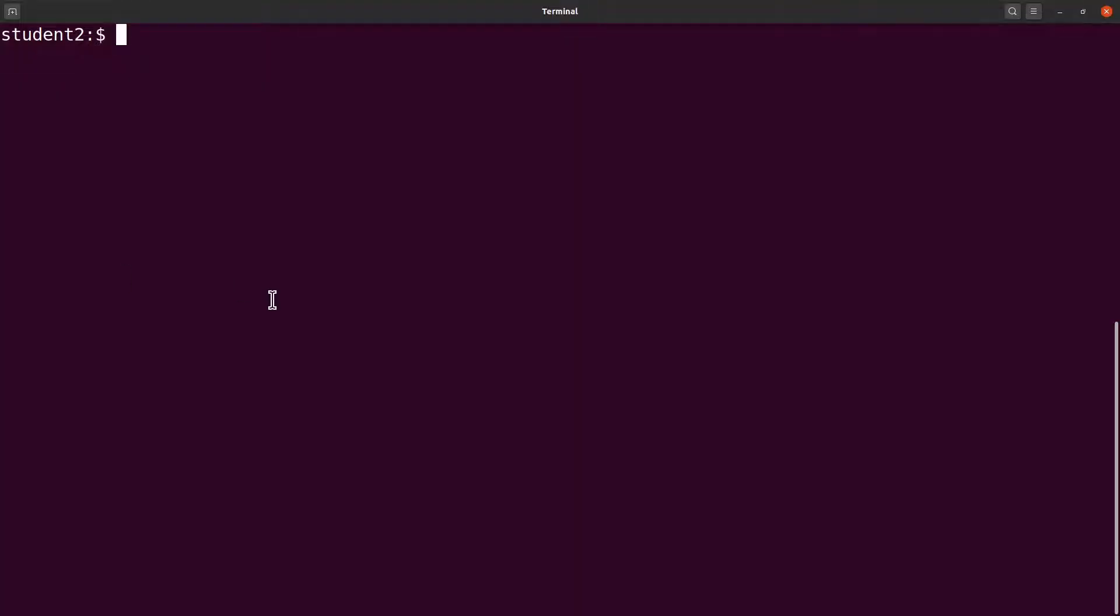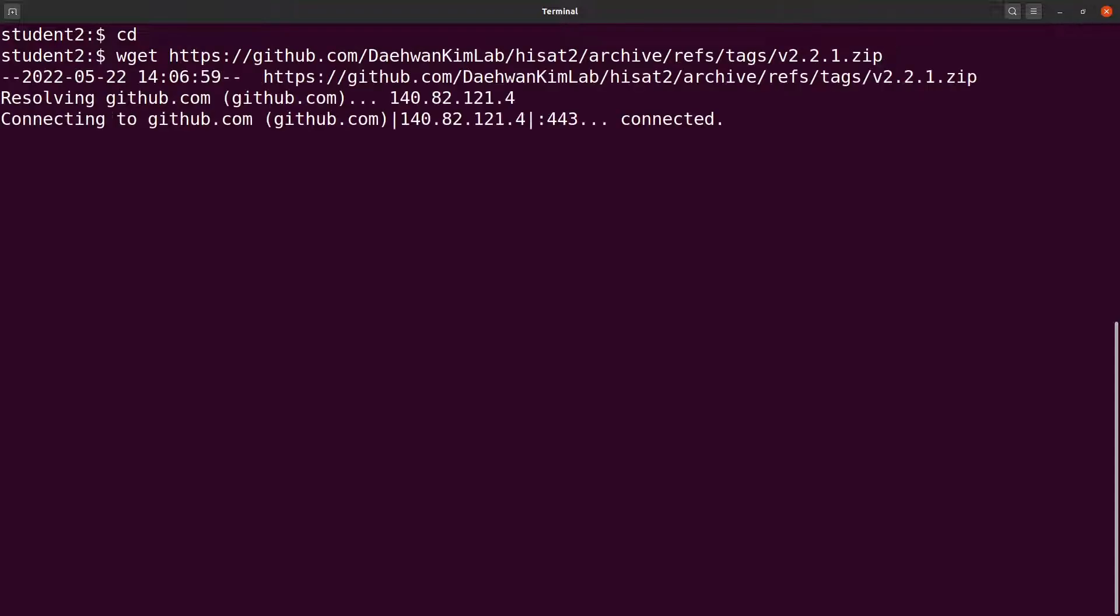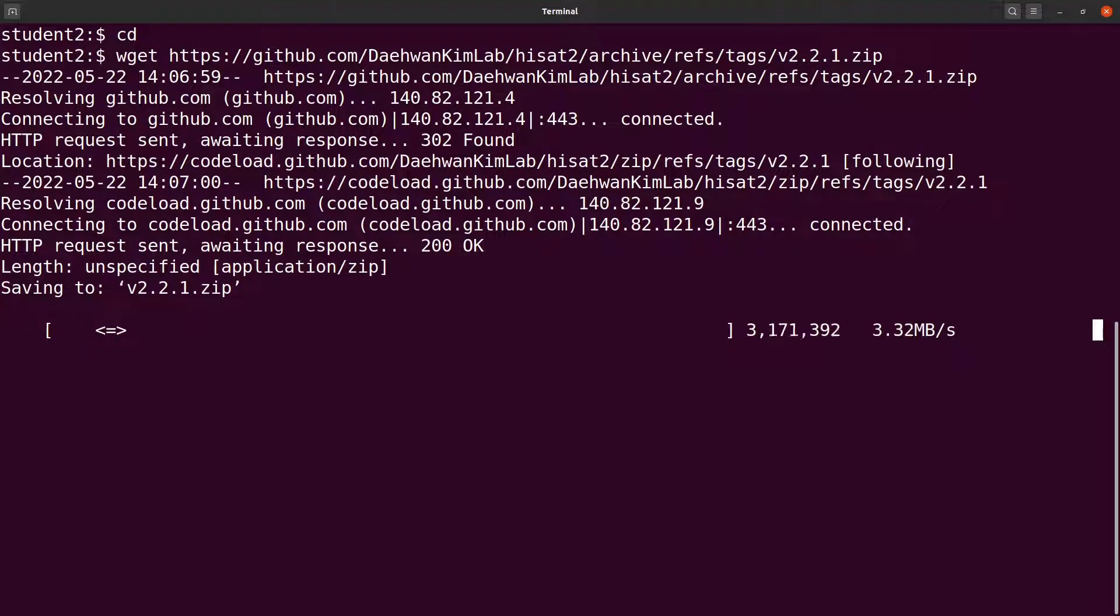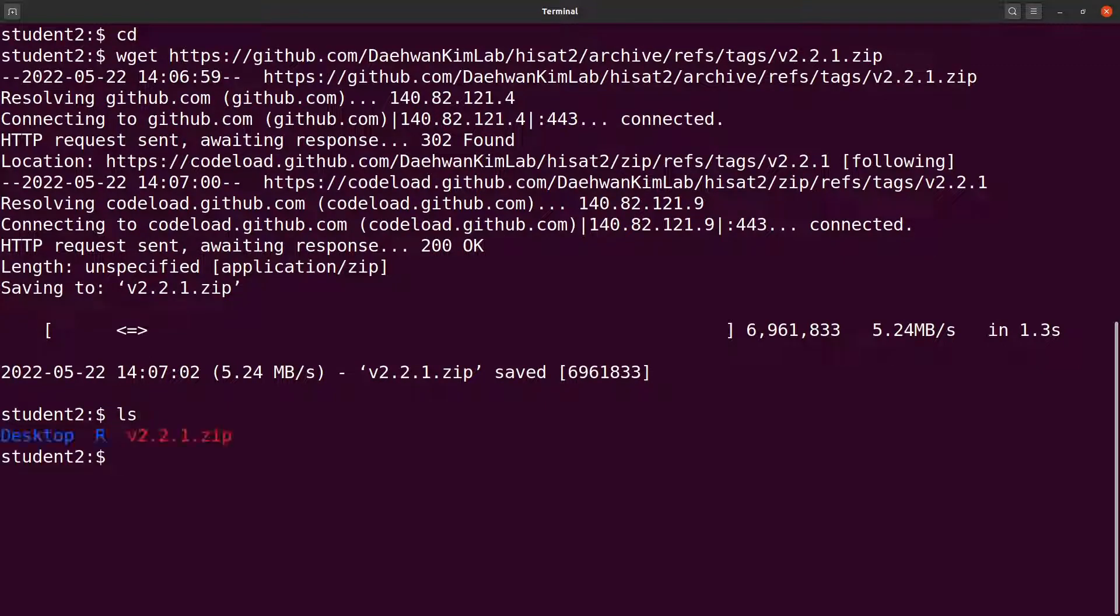We are on the terminal now. On the terminal, I will cd to my home directory first. And then, I will use wget to download the file. I have it downloaded. Do an ls and you will see a file there. Let's clear the screen and continue.